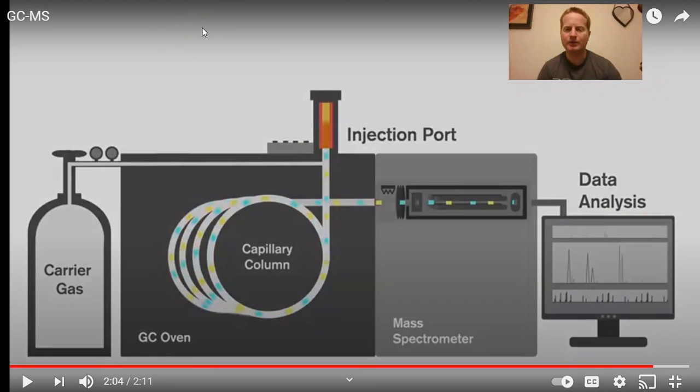Okay, so just like she was saying, you take your sample from the scene, right? Your accelerant, you put it in here. As it vaporizes, it passes through the column where it's separated. So the column essentially slows it down, so it gets separated, and then it runs through, and the mass spectrometer does the analysis on it and spits out this graph at the end.